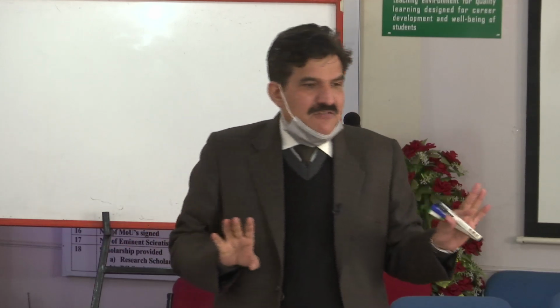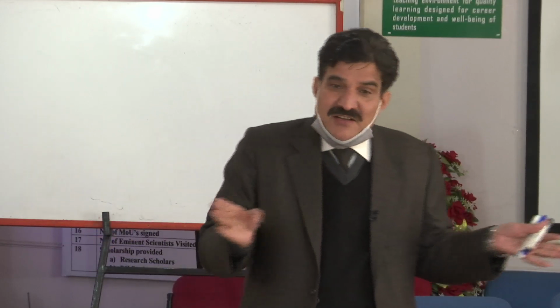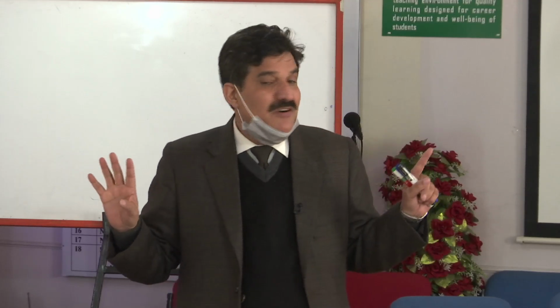Finally, what is coming out? We are associated with only one thing, that is DNA. We are only taking that thing into consideration. What is happening to the others, we are not bothering about.